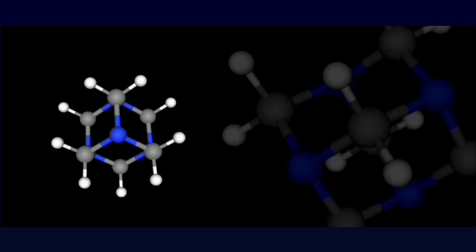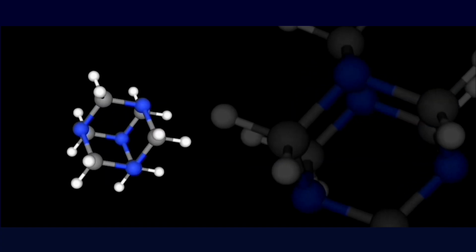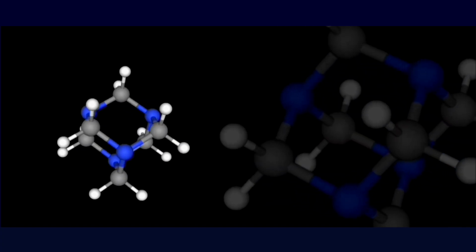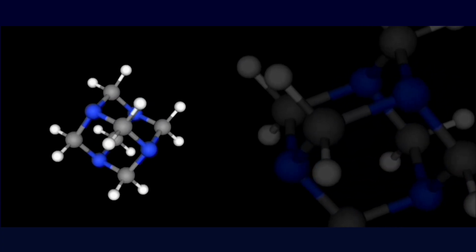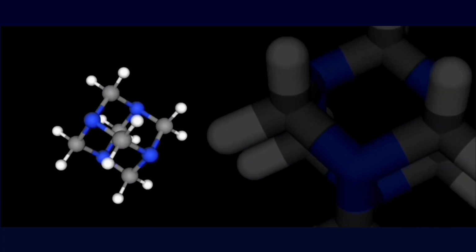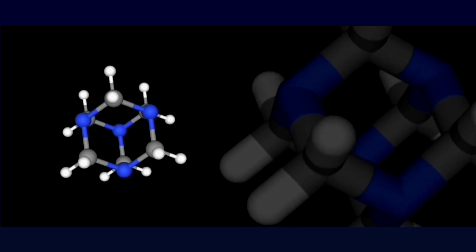In order to separate the ammonium chloride from our methylamine hydrochloride, fractional crystallization can be performed. The problem with this is it requires many recrystallizations because as something crystallizes, it includes molecules of the other substance within its crystal lattice. So things need to be dissolved again and crystallized again and again and again to get higher purity. Recrystallizing from 100% ethanol is the way to go because ammonium chloride is not soluble in ethanol, but methylamine hydrochloride is.